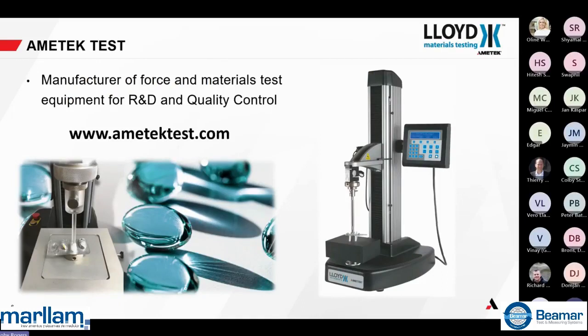Just to give you an idea, here we have a tensile compression testing machine, which in this example is being used to push some tablets through a blister pack. It's that kind of testing that we're going to be focused on: pulling, pushing, whether it's blister packs, syringes, and so on.